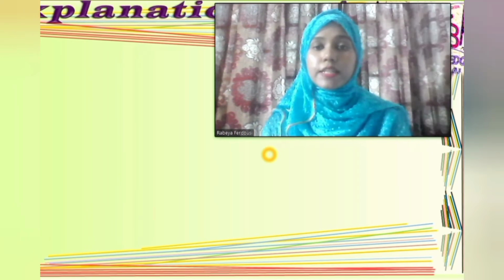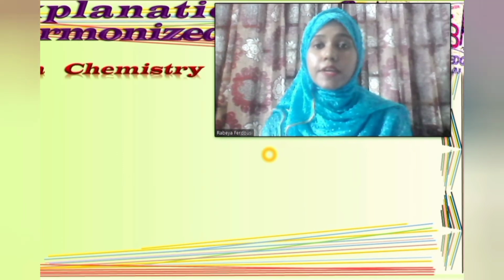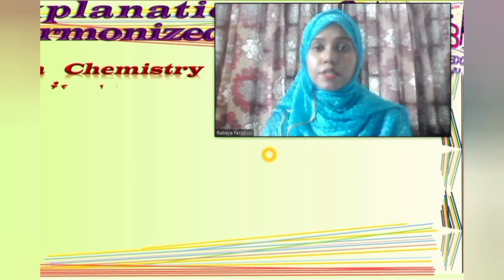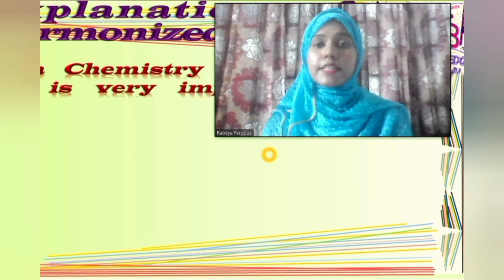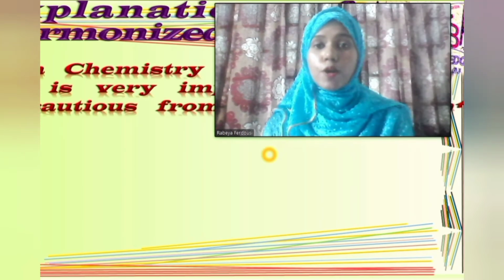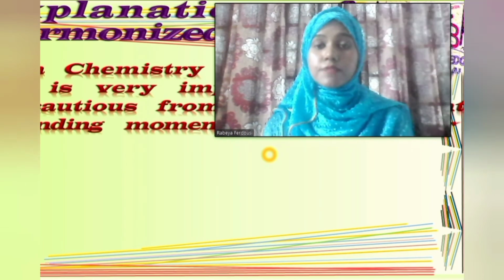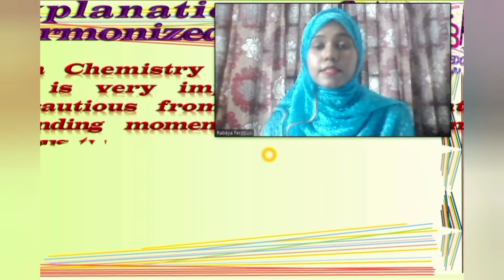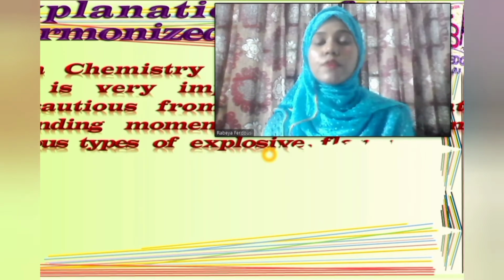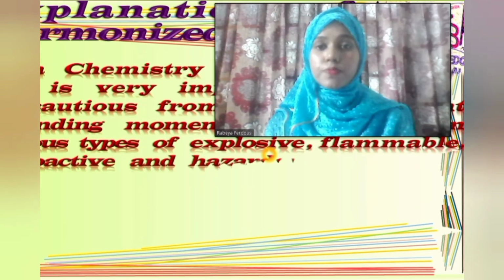Since we don't want any type of accident or injury to happen to us, we have to adopt cautiousness from starting moment to ending moment in a laboratory. Therefore, in a chemistry laboratory, there remain different types of hazardous, flammable, explosive, toxic, dangerous for environment, and radioactive substances. This is the reason anyone in a laboratory should adopt safety measures, obviously during the time of experiment.